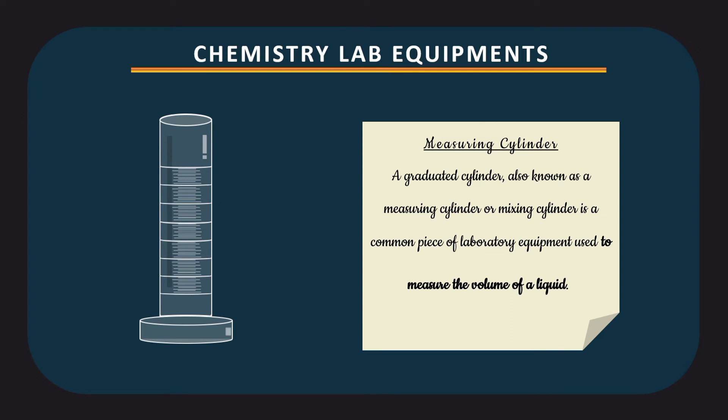Graduated cylinder, also known as measuring cylinder or mixing cylinder, is a common piece of laboratory equipment used to measure the volume of a liquid.